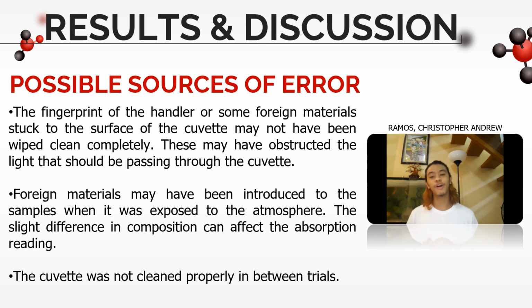We could avoid these possible sources of error by being careful and meticulous in conducting this experiment. So we must ensure that the cuvette has been thoroughly cleaned and wiped before introducing a new batch of samples and before putting it inside the spectrophotometer.